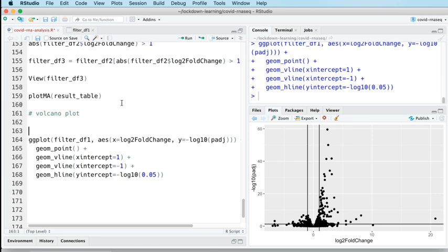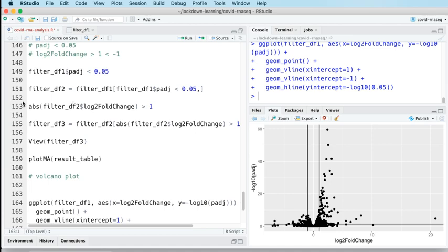So if you remember, we did these tests yesterday. So we've got this one here. We're working with df1 rather than df2 though. And we have this one here. These are our two tests. But we want to combine those tests.